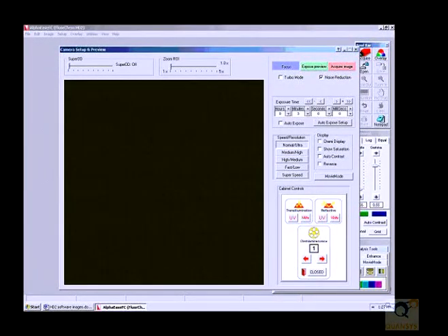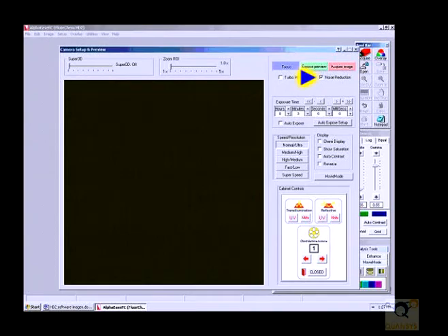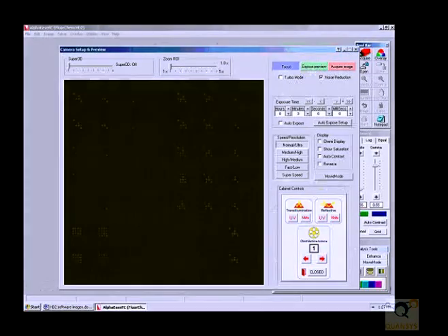Set the software settings on the computer to no lights on, resolution to normal ultra, and nothing should be checked in the boxes but noise reduction. Set the exposure time to 3 minutes for the first time. Click on Acquire Image when ready to take the image of the plate.